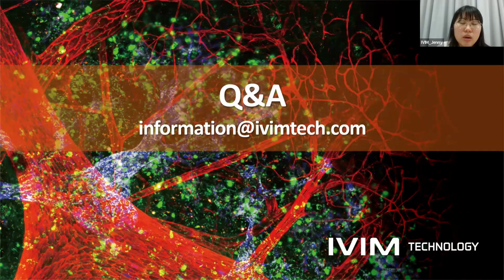But if I talk about the cranial imaging window that I presented in my presentation, if inflammation is dealt with very well, the mouse can live up to at least 3 months and even up to a year with the window implanted in its brain.